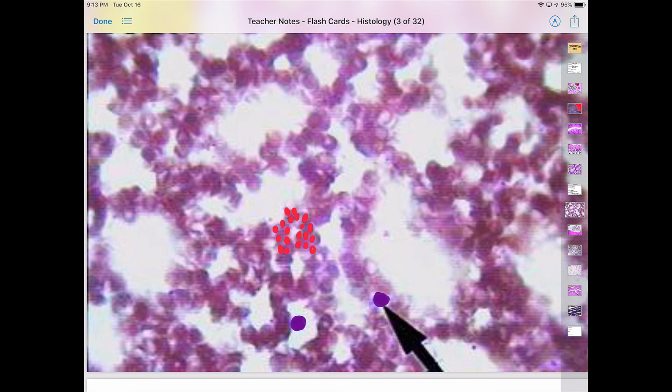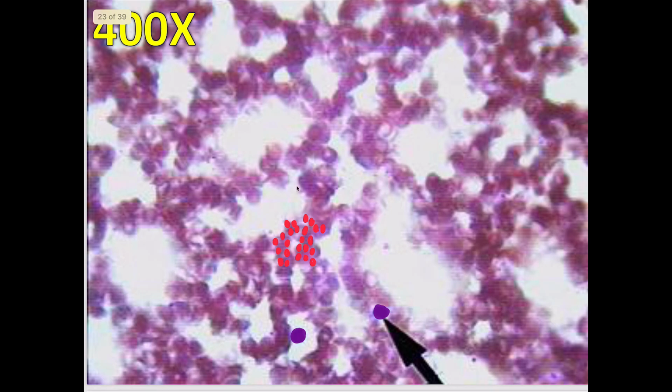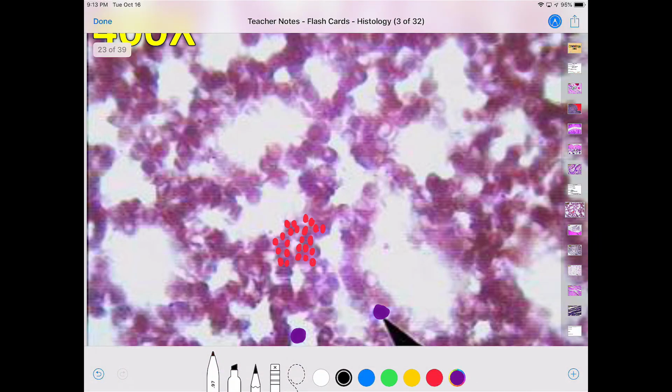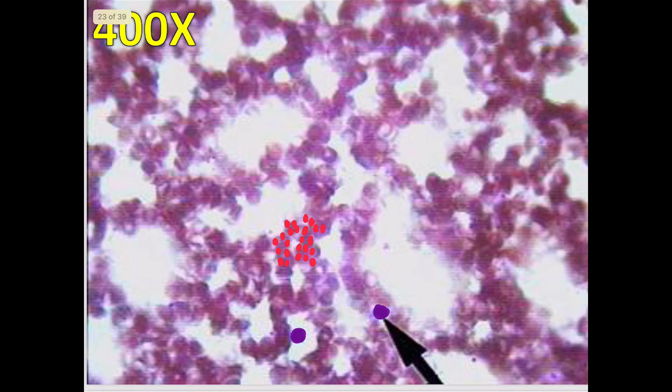And if you haven't figured it out already, this is blood. Now, again, as you learned on your brace map, the majority of all connective tissues, recall, is non-living. It's this extracellular matrix. And then blood, that's really, really straightforward. That is blood plasma. So all the white stuff that you're seeing here is not just the microscope slide, right? This would be plasma between the cells. The majority of your blood is blood plasma.